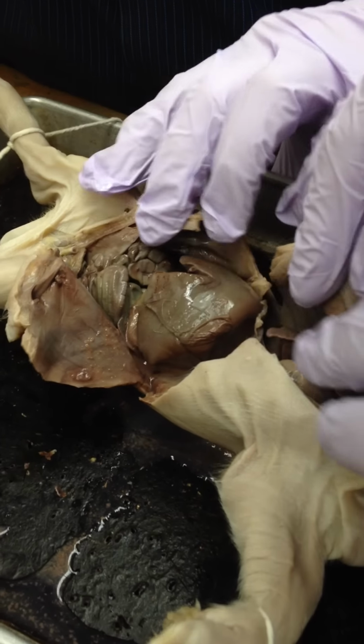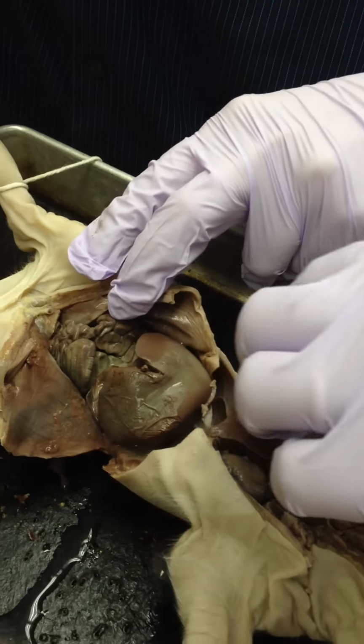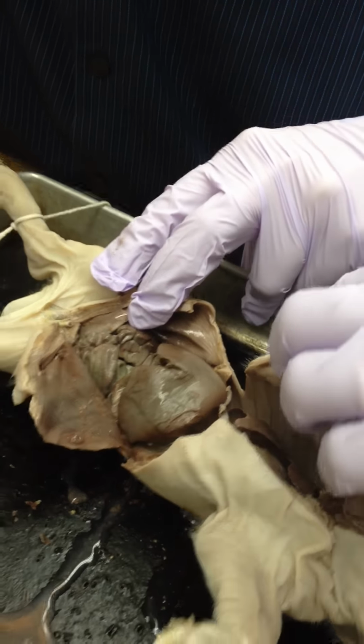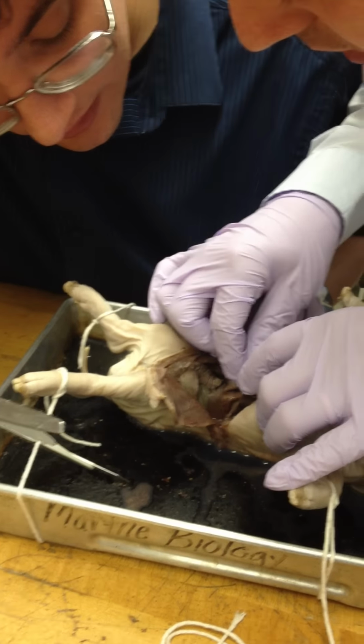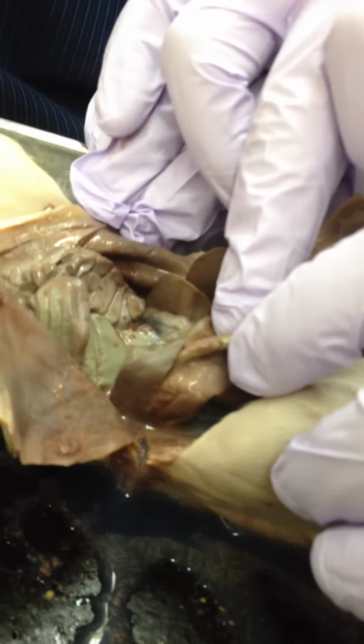Hang on, let's tip it again. I made a bigger incision. Perfect. Cut it all the way if you want to. Yeah, I definitely cut into something I shouldn't have to make all this goo go everywhere. There's a stomach, and wrapped around the stomach has to be the pancreas. I think so. Yeah.